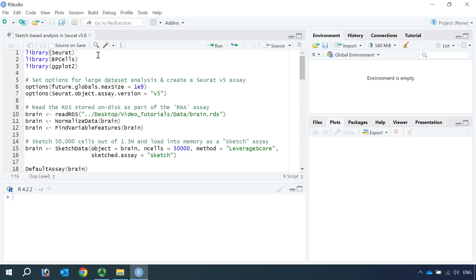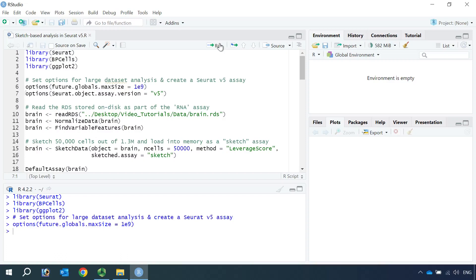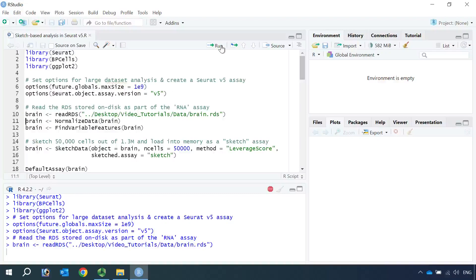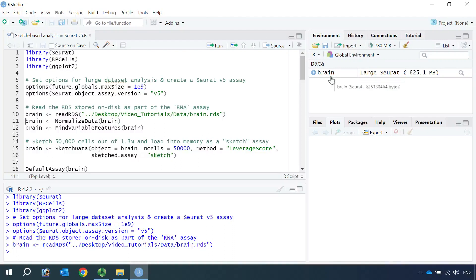First, let's load all the packages: Seurat, BPCells, and ggplot2. We need to set a maximum size for the future package and also set the option as Seurat v5. In my Seurat v5 video tutorial 1, we loaded the 1.3 million cell dataset and saved the count matrix on disk using the BPCells package. We also created a Seurat v5 object and saved it as brain.rds. For today's analysis, we can simply read the data in using the Seurat function readRDS. You can see in the data window we have the brain Seurat object.